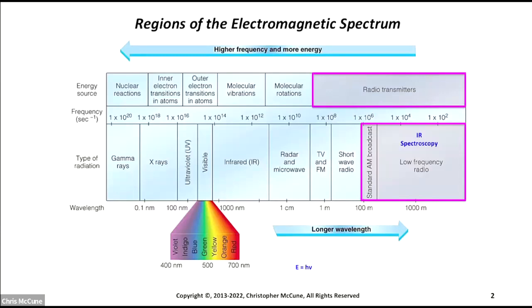Here, we're going to be looking at proton decoupled carbon-13 NMR. So you're not going to get any splitting pattern based upon how many hydrogens are present. Okay, so carbon-13 NMR is a lot simpler to understand and interpret than a proton NMR for that reason, really.